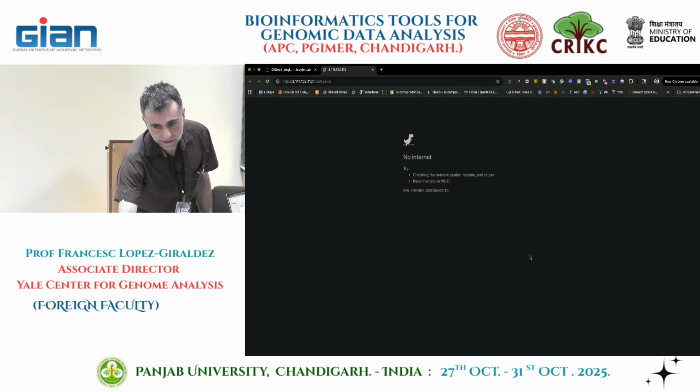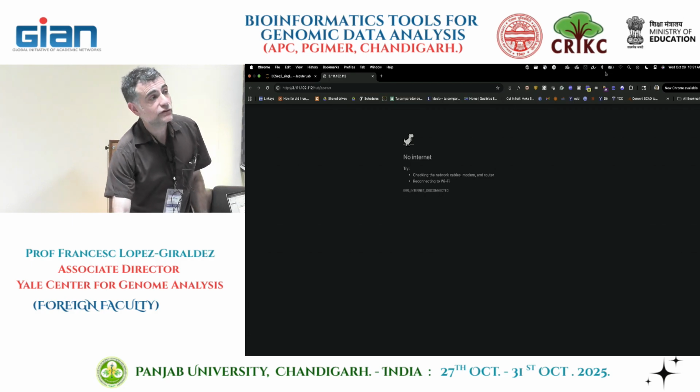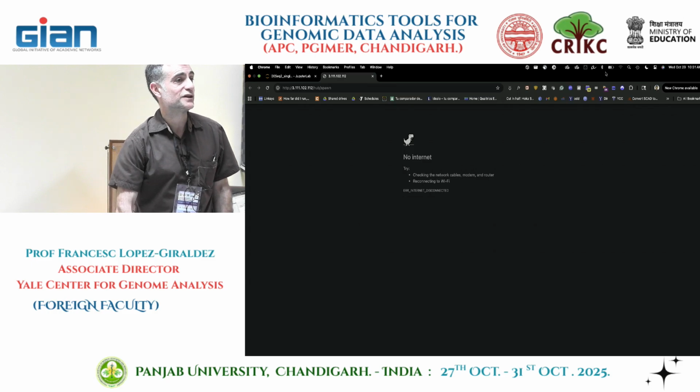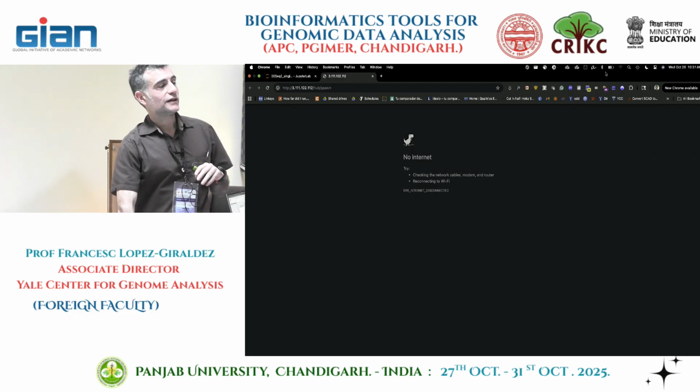Did it die? No. For one gene, it was showing NA. Why was that? You probably don't have data. So there are no counts for normal, there's 0, or there's another reason.